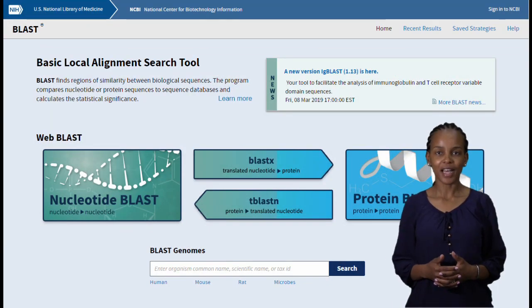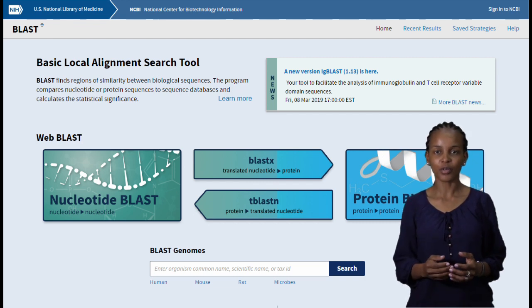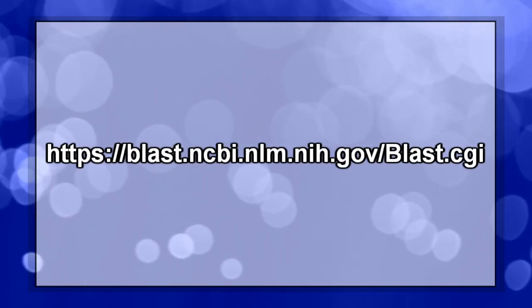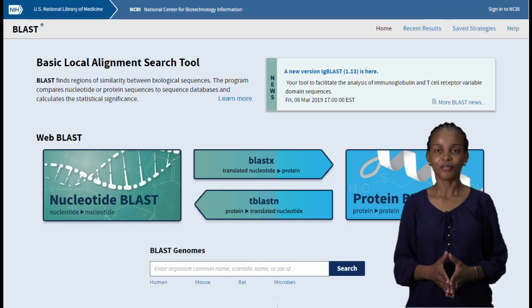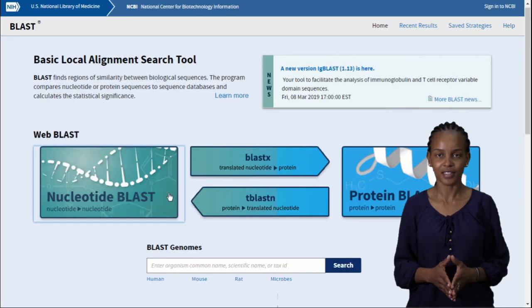Now let's get some hands-on practice. Feel free to pause the video so you can follow along at home. First, we shall head to the following website. There is a clickable link in the video description. We shall first navigate to this button that says Nucleotide BLAST.